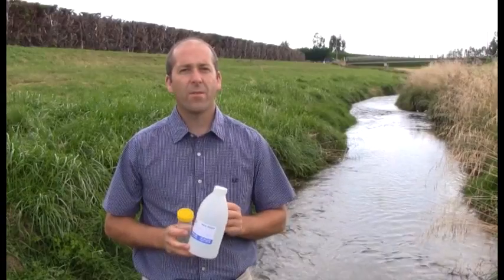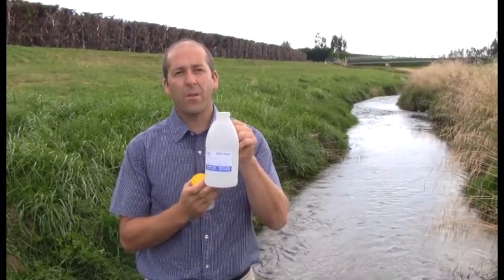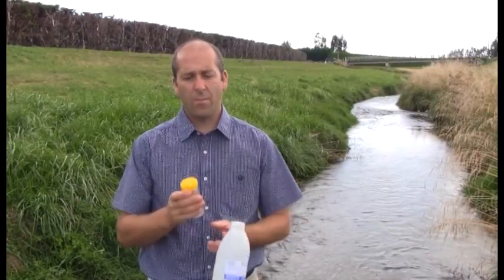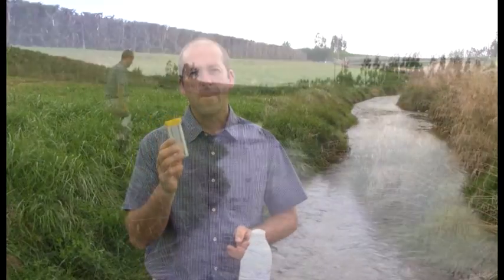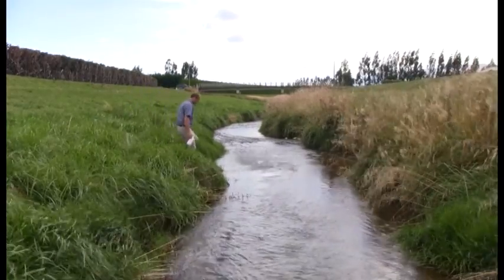For the Otago water plan there are two types of sampling bottles which will be needed. The larger one will be used for nitrates, phosphorus, and ammonia, and the smaller one will be for E.coli — this is a sterile container. When you're taking the sample you want to enter the stream from downstream of where you'll be sampling.